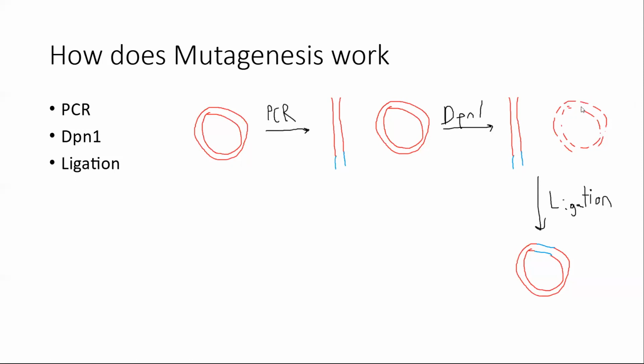But when we use PCR, there is no methylation that occurs unless you add in a methyltransferase or something else, which could be used to selectively cut out things with DpnI. But you just got to make sure wherever you do that, you're going to have corresponding bands that allow for successful ligation. And then because it's cut up into so many pieces, the original template DNA is now gone.